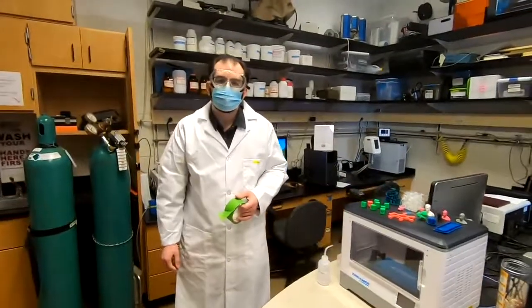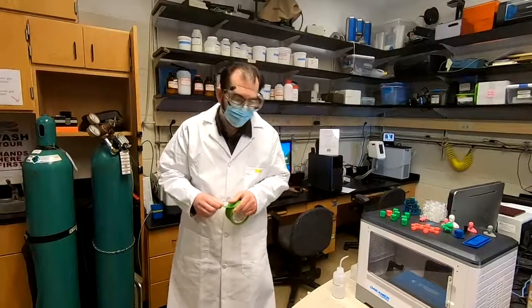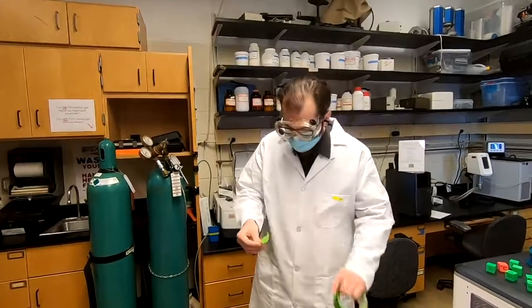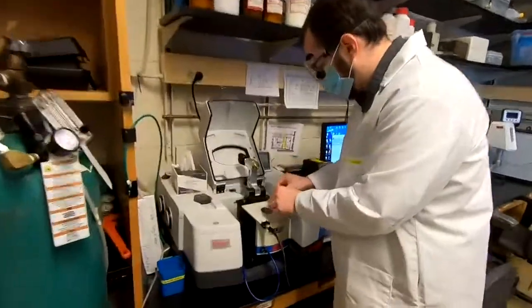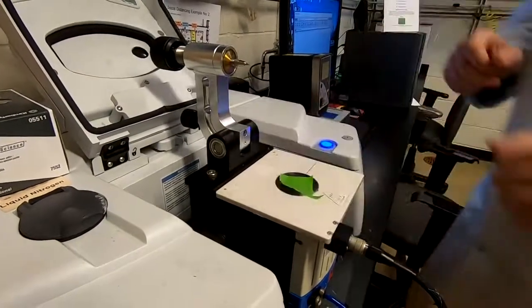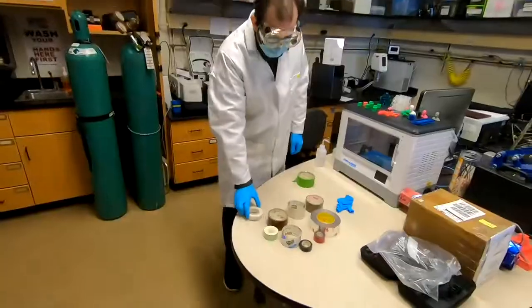Hi, I'm Keith DeNivo. I'm a fourth year student in Professor Yu's laboratory. Today we're going to measure the different adhesives found in common household tape. You just have to simply take the tape and put it on top of the diamond crystal that's right here. Press it flat. Then you can just say collect sample.